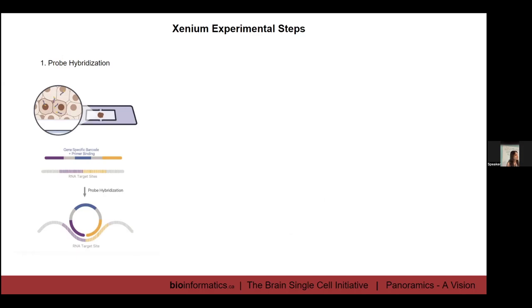Question. Is there no possibility to submit a fresh sample? You mean fresh frozen? No, fresh. Like, to have the analysis done, like some mutation, single cell RNA plus single cell ATAC, where I submit the cells just after sorting. No, you cannot do that.